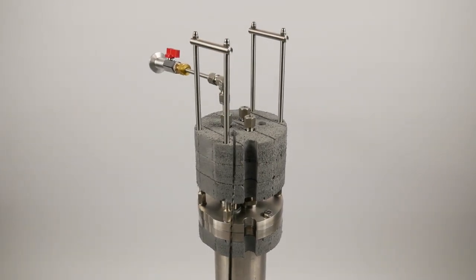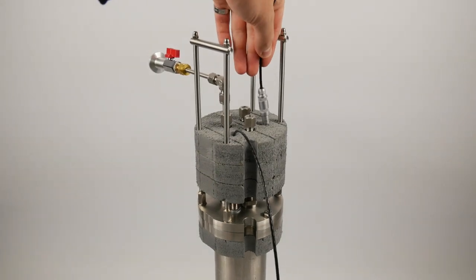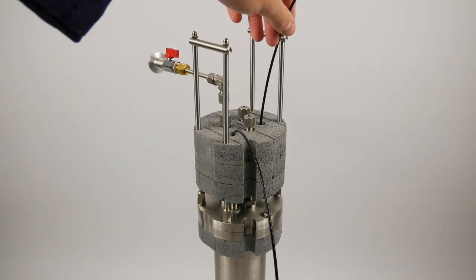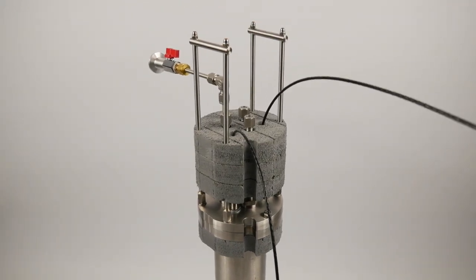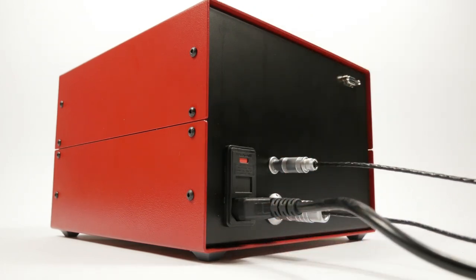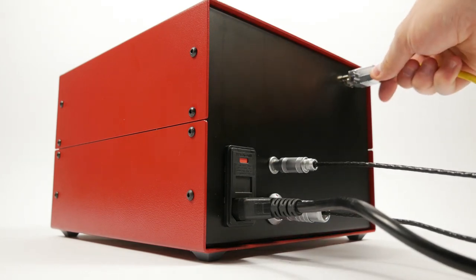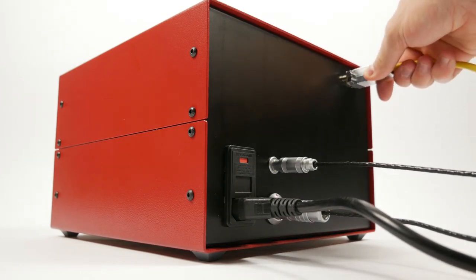Here we're showing how we connect the control box to the cryostat. These cables control the heater and bring the temperature sensor from the cryostat to the temperature controller. We simply have a mains connector and also an RS422 to allow connection to a PC, and we include a cable and some software to do that.